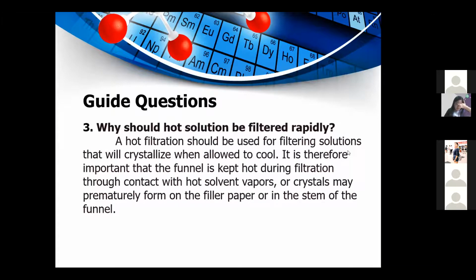Number 3, why should a hot solution be filtered rapidly? A hot filtration should be used for filtering solutions that will crystallize when allowed to cool. It is therefore important that the funnel is kept hot during filtration through contact with hot solvent vapors, or crystals may prematurely form on the filter paper or in the stem of the funnel.